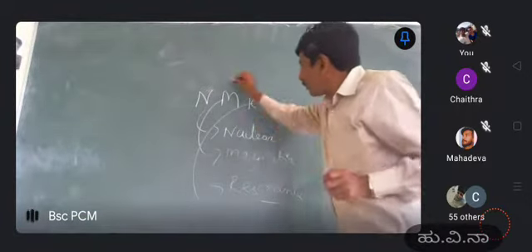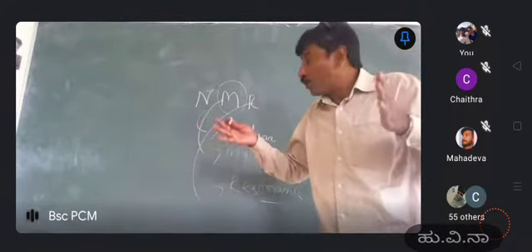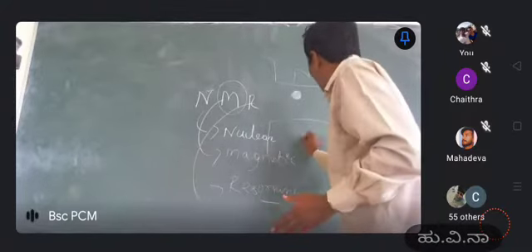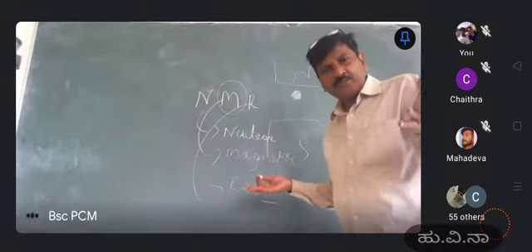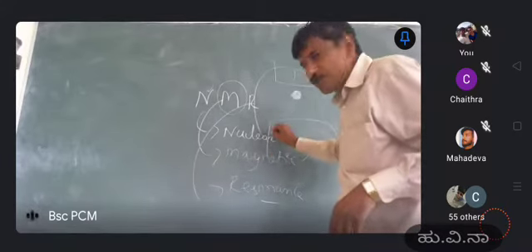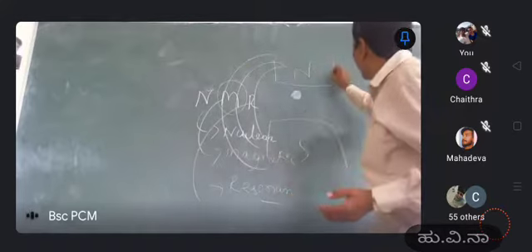Now, what is this magnetic field? It is the applied magnetic field, the external field applied to the nucleus. Suppose this is the nucleus and this is the applied field. You have all studied these things in physics: magnetic lines of force start from the north end and terminate at the south end. Similarly, the same happens here.